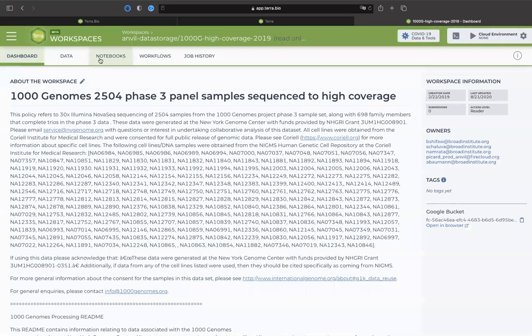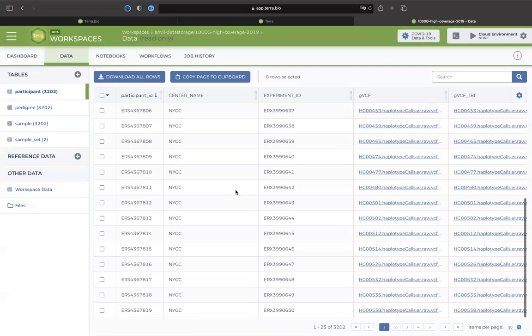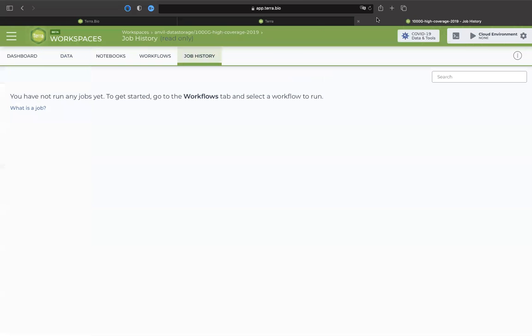And when you look at the data, there are some participants, but a lot of things to really explore, right?